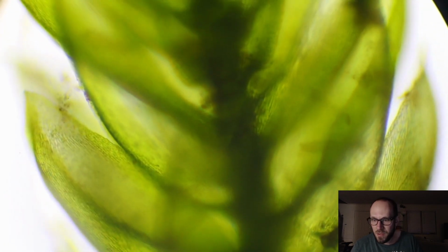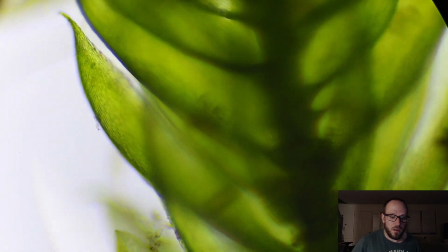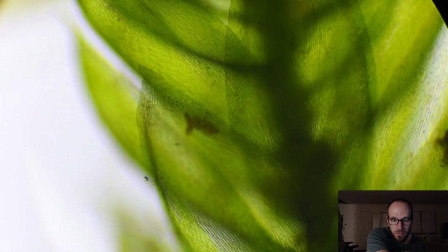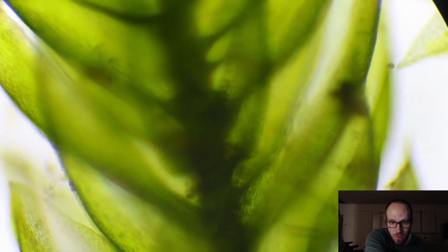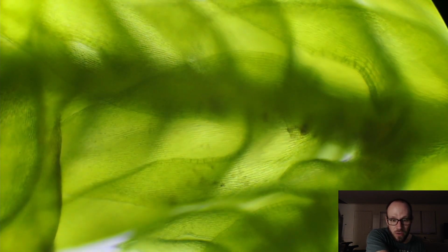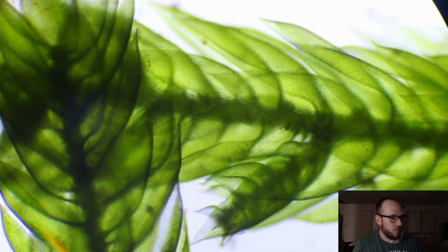Imagine 1000x would be a pain to keep centered as well. Yeah, you need to have a slow-moving target or something of that nature. But you can see behind this leaf there are still tons of rotifers moving around. Which is why I'm so confused that I have not found any tardigrades. Like, why are there so many rotifers but no tardigrades at all? It's so weird to me. I feel ripped off.